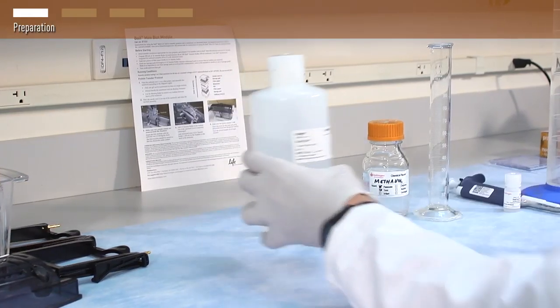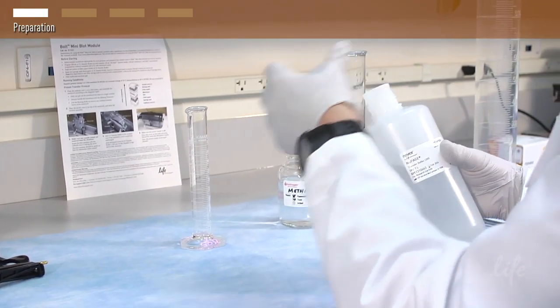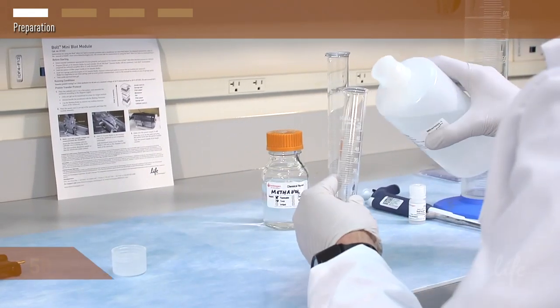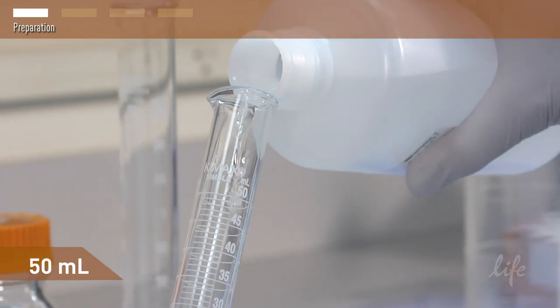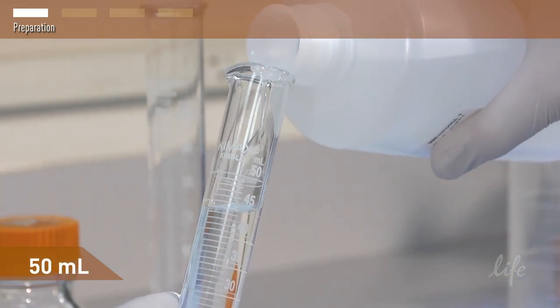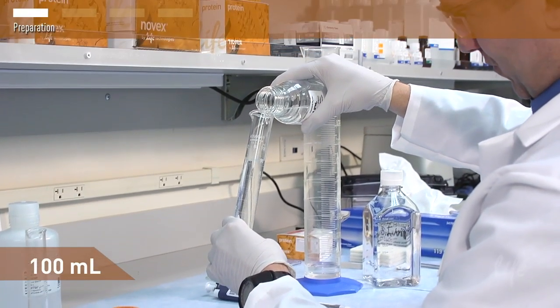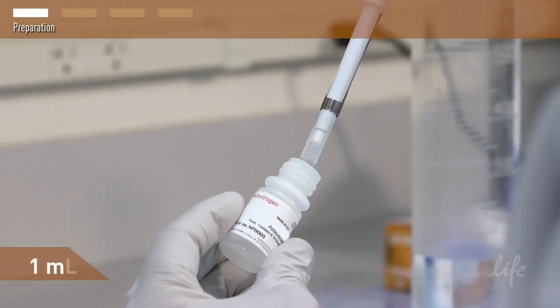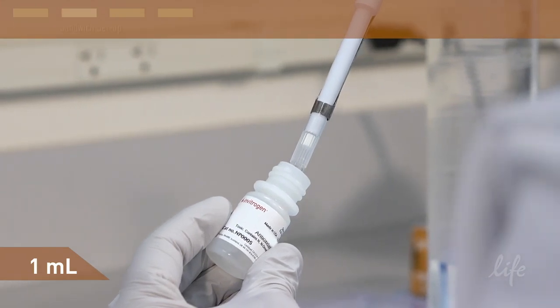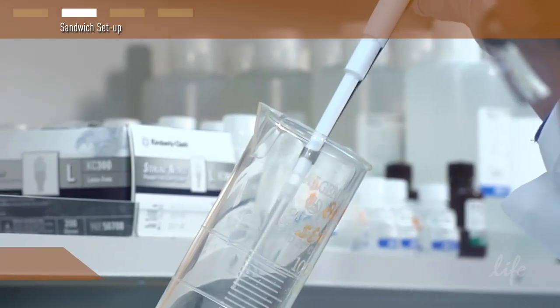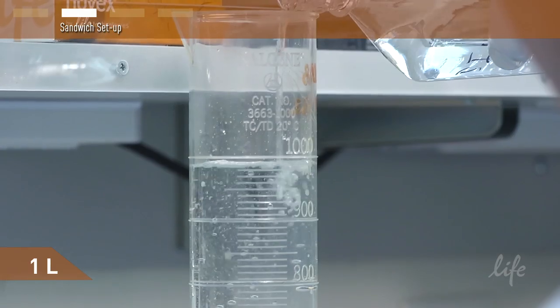Approximately 250 milliliters of transfer buffer is required for each transfer. Prepare transfer buffer by adding 50 milliliters of 20x Bolt transfer buffer, 100 milliliters of methanol, and one milliliter of antioxidant, bringing up the total volume to one liter with deionized water.